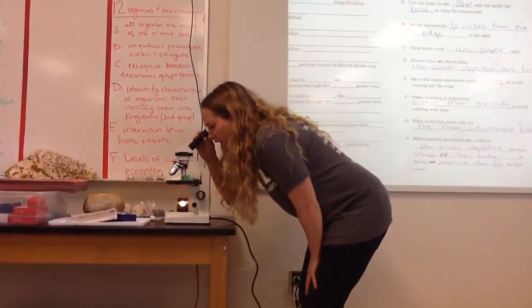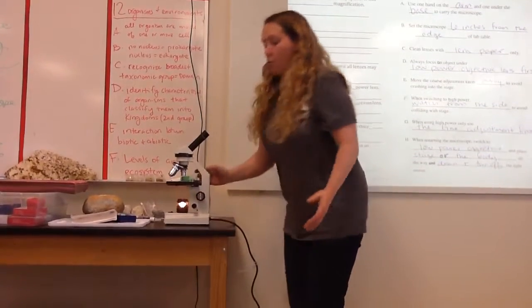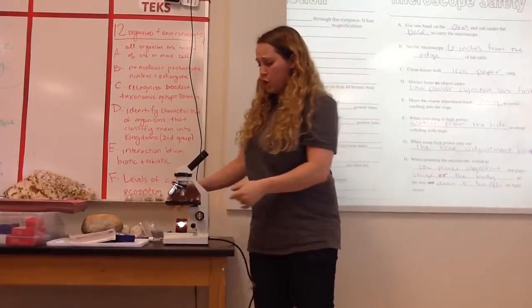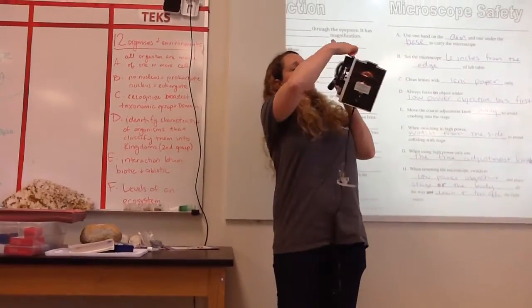I'm not getting very good lighting, so maybe something's not set. Okay, there we go. When I looked, it looked too black, like not any light coming through. So in my mind, I'm like, what's wrong? Okay? In order to show you, I'm going to remove the slide. So there's this thing under the stage. It looks like a big disc.